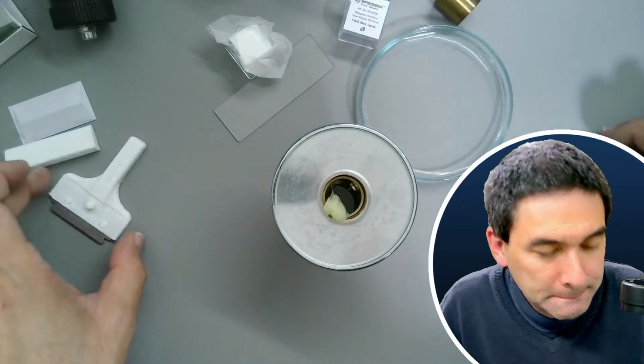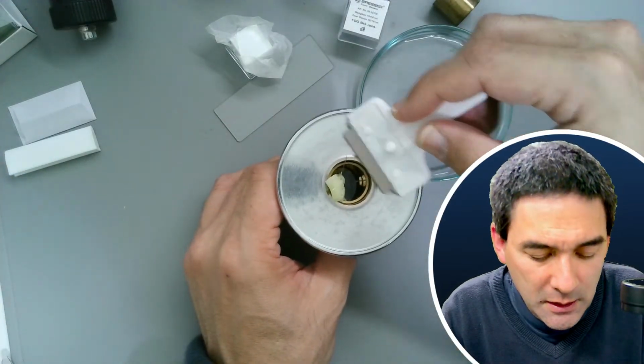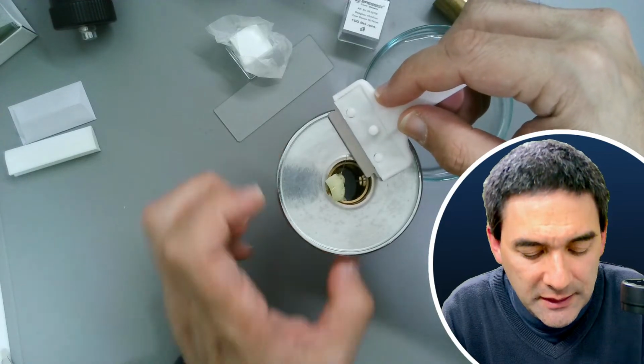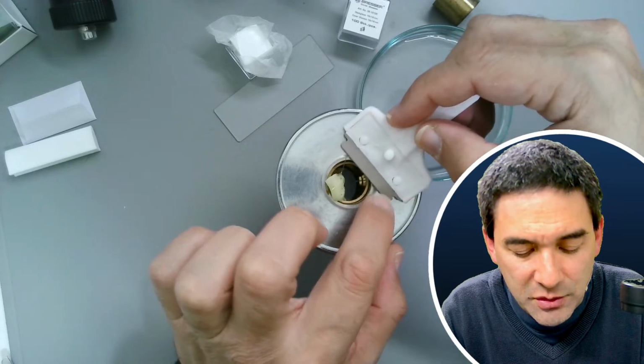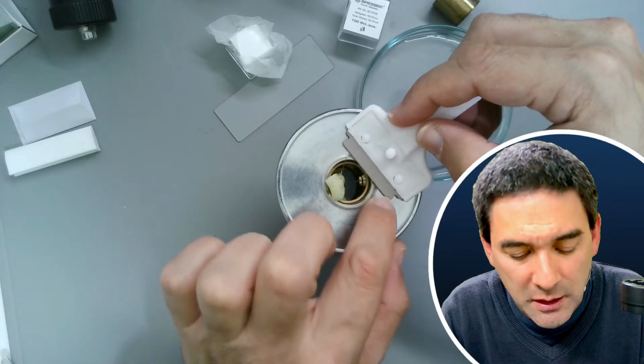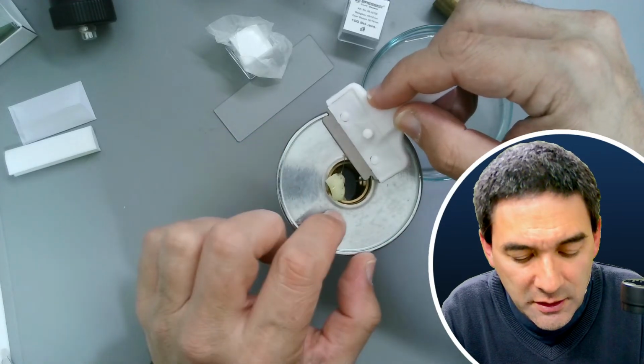Let's give it a try. When cutting, make sure that you don't cut like this. There should be the guide on both sides. The blade should be resting on the left and on the right side, and not like this. It should not be suspended.